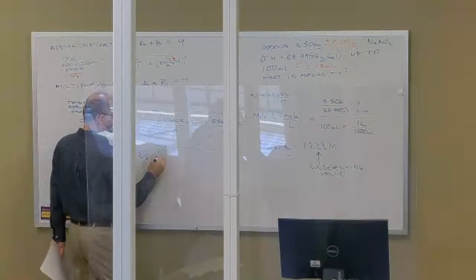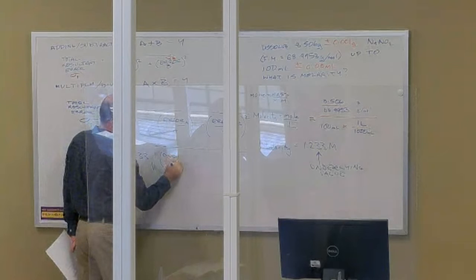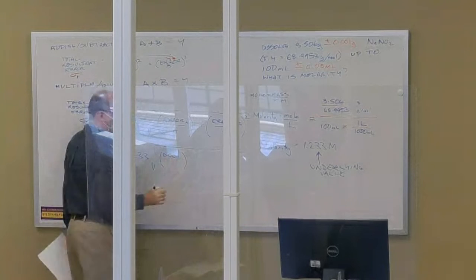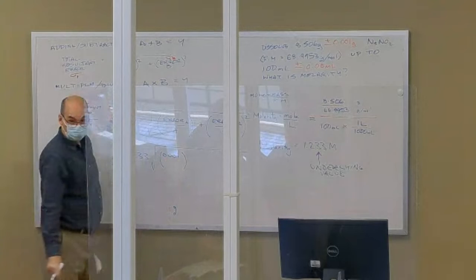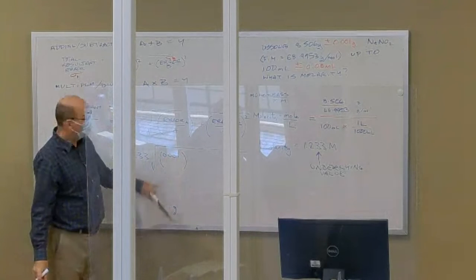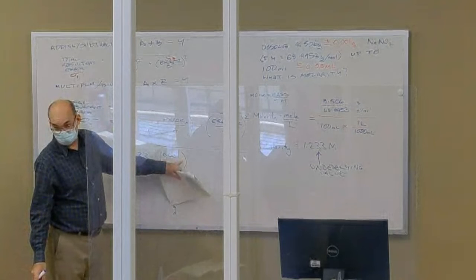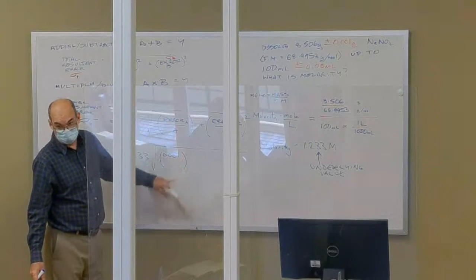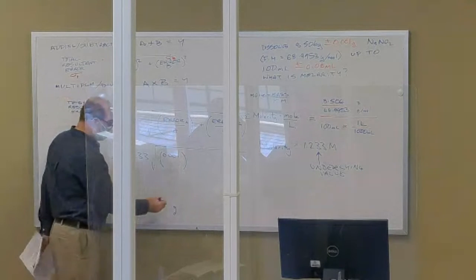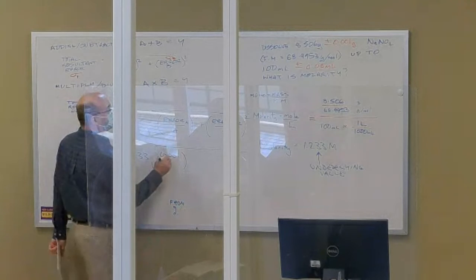My first measurement is plus or minus 0.001 gram. I'll put a note to myself at the bottom that that's for the grams, so when I come back and read it, I know where it's from. I don't know that I really need the units in this because my answer is a dimensionless quantity, but this is from the grams.